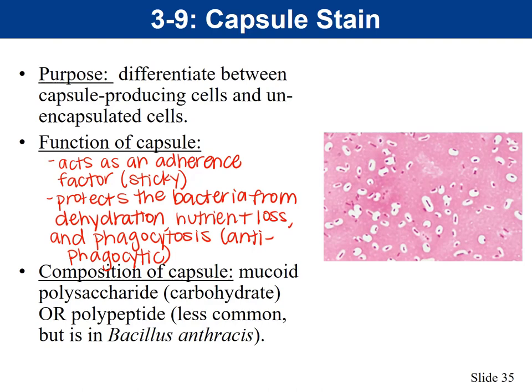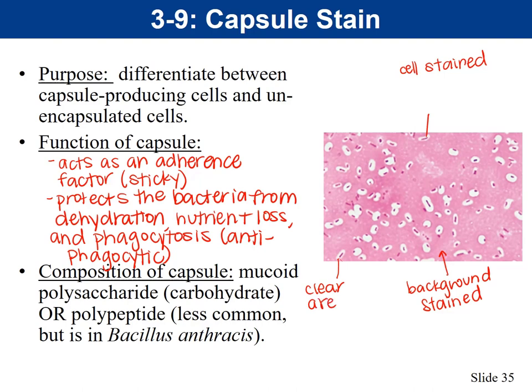Notice in this capsule stain that the background is stained, and the part in the middle — that's the cell — is also stained. You can see in between the background and the cell a clear area, and that clear area is going to be the capsule. All of these clear areas around the cells are going to be the capsules. What type of dye do you think is used where the background is stained? The answer is we're going to use an acidic or negative stain.